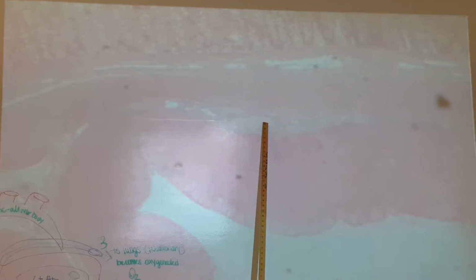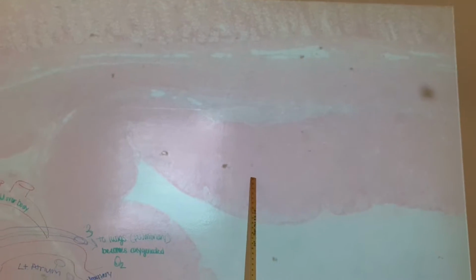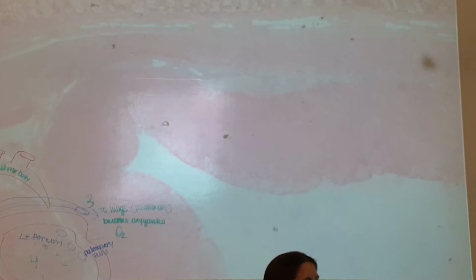Horrible. Yeah, because it's twisting back on itself here. This thing, you see it there? You know it's bad. That's going to be your ganglion and myenteric plexus right here. So again, circular, longitudinal. Is the ganglion always continuous? It is always. Okay.